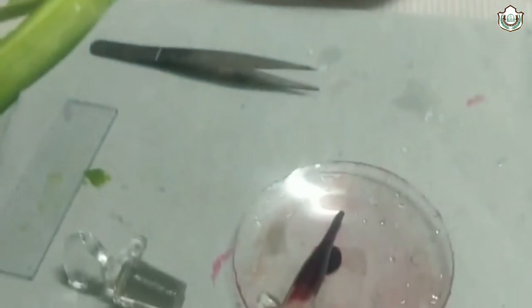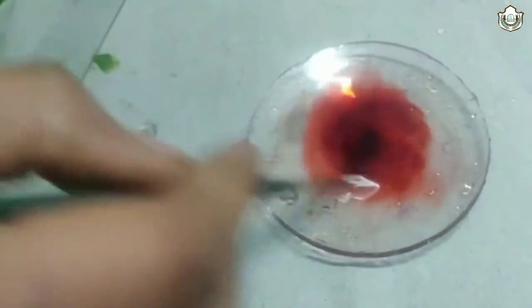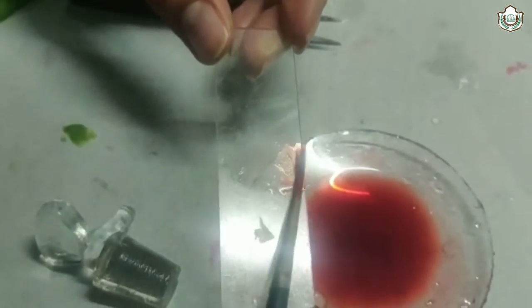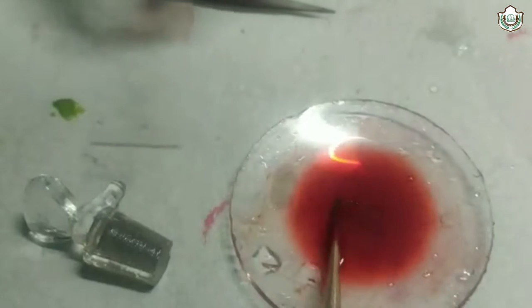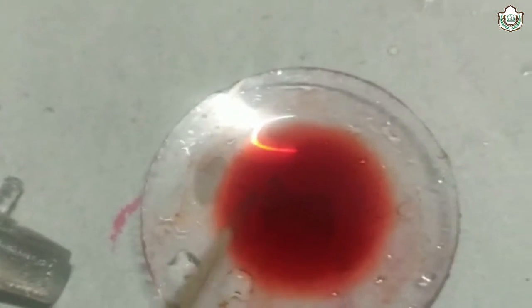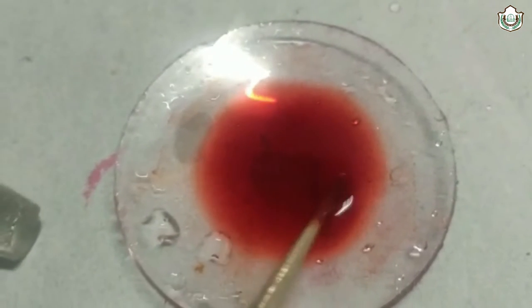Now gently take a drop of saffronine and mix with water like this. Now gently take the peel and place it for 2-3 minutes in saffronine stain so that it is stained.